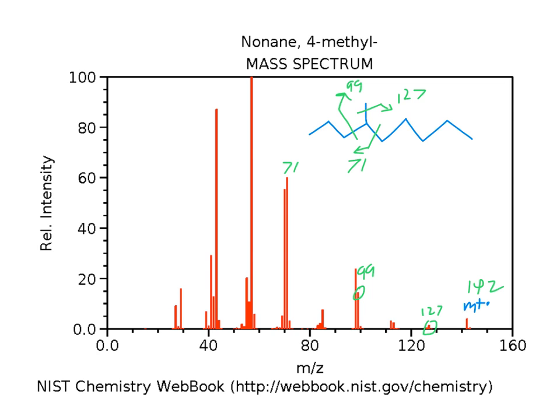So I guess what's happening is either we're cleaving here and the cation is going to the small piece, what would seem like the less stable one, or, though I think this is not what we usually talk about, it can also do some sequential cleavages. So if we form a cation like this, then we can have these electrons go like this, and we form a new cation and a neutral alkene.